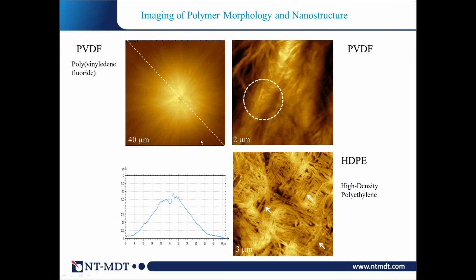For example, if you take this spherulite, it's smooth but corrugated, but there is not much local corrugation. It's just the surface, let's say, of the ball here, 1.2 micron or 55 microns, and this is a spherulite. You can easily look at the structures, zoom in, and distinguish the lamella organization in these beams of the structures.